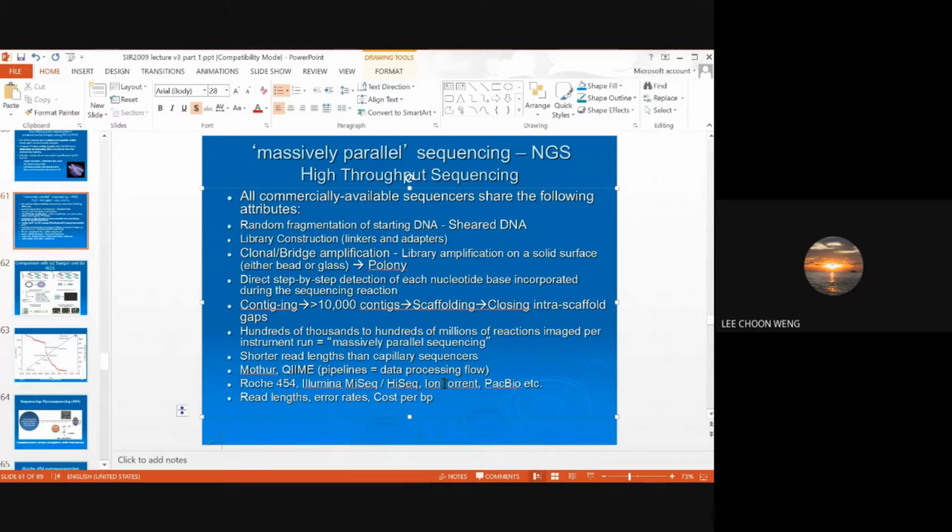Okay, because the reads are long, but because of the error, they will usually. So nowadays when scientists use PacBio, they use it to read the whole genome of a microorganism or maybe one full chromosome of a human or human genome project.